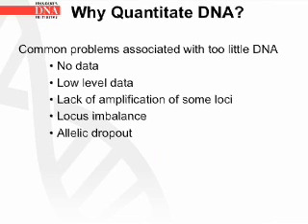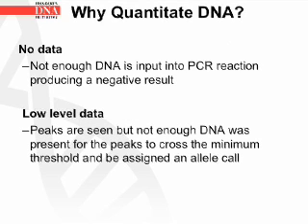At the other end of the scale, there are common problems associated with too little DNA. You can end up with no data, low level data, lack of amplification of some loci, locus imbalance, and allelic dropout. No data simply means there is not enough DNA input into the PCR reaction and therefore you get a negative result. Low level data means that peaks are seen but not enough DNA was present for the peaks to cross the minimum threshold and be assigned an allelic call.